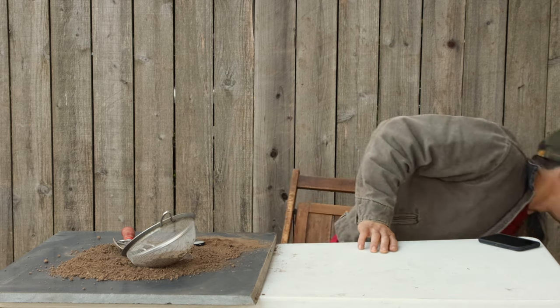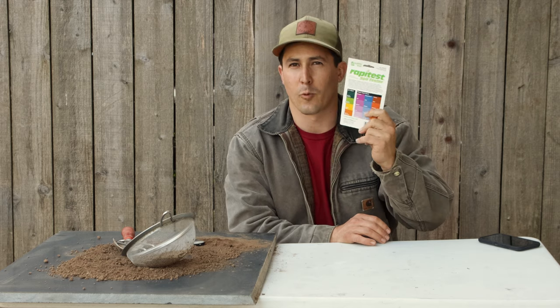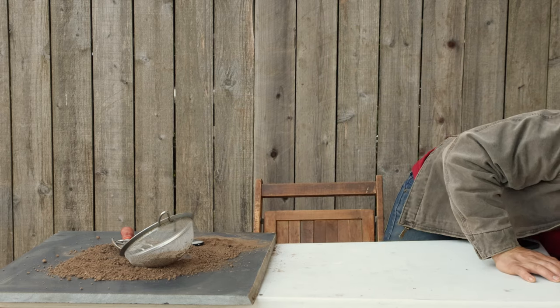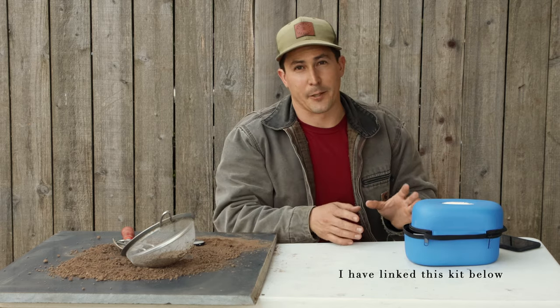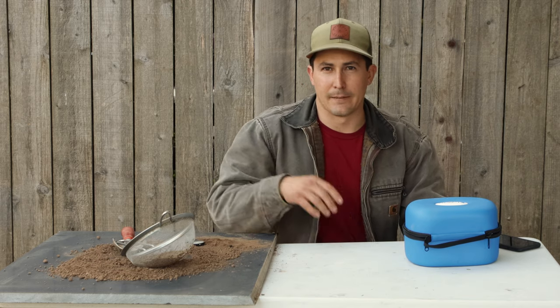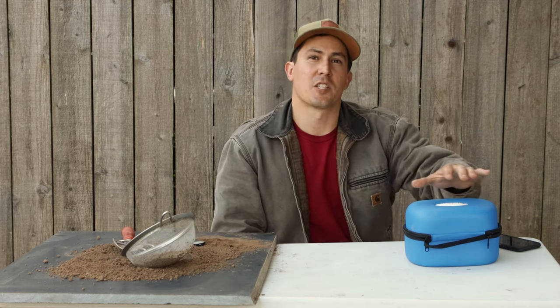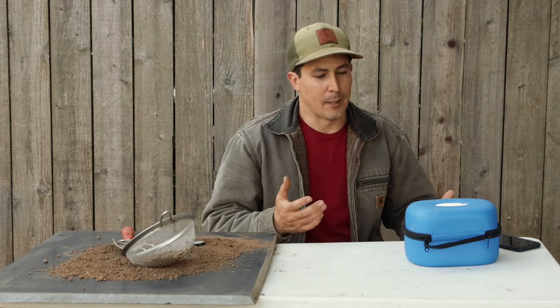The Rapid Test Kit was an okay test. I probably won't do this test again because it's a one-time kit — you buy it, use the tablets, see what you've got. Not completely accurate, but not completely inaccurate. The LaMott test kit was very accurate, very close to the soil analysis from the professionals in the lab. And I've got enough chemicals, test strips, tablets, and banana pills in this kit to test my soil about 20 times. I'm going to amend the soil, test it again with this kit, see where it's at, test it at the end of the season, see what I need to add, and go from there.